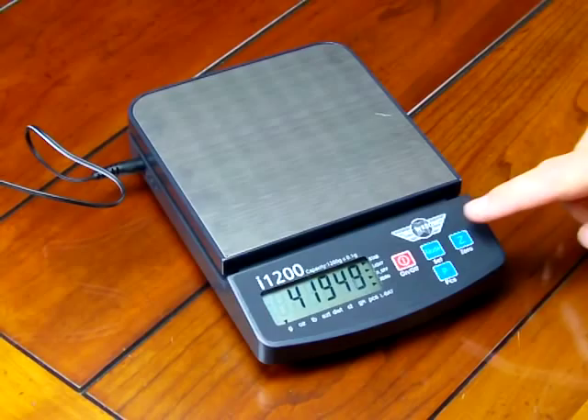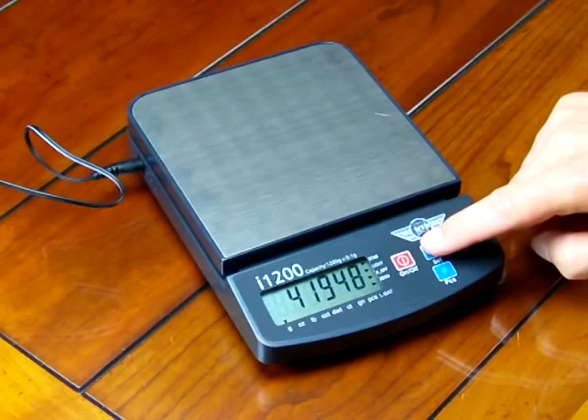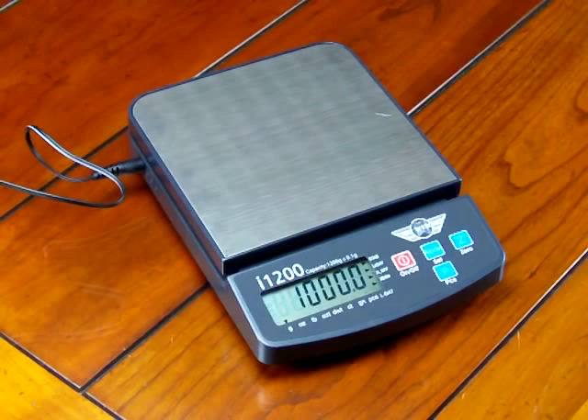To store it, we're going to press the mode set button. When we press it, we'll see on the display it's going to show 0.0 save. So we press it once and you'll see 0.0 save.